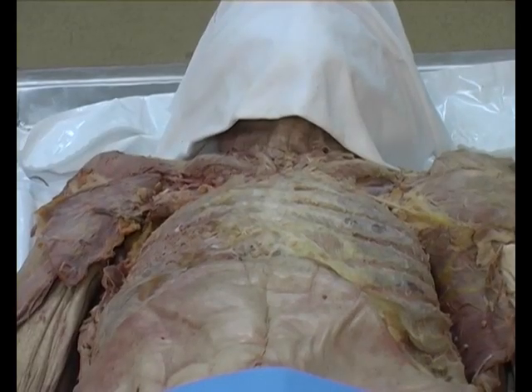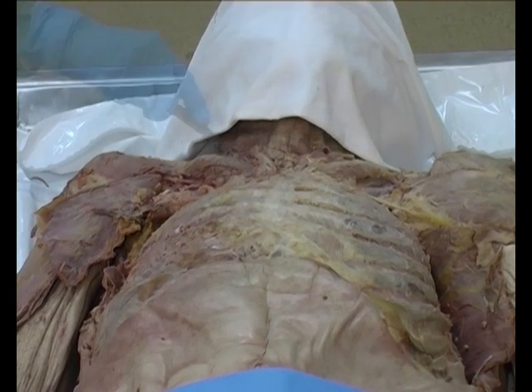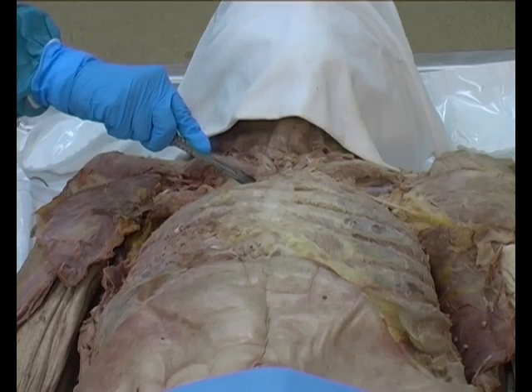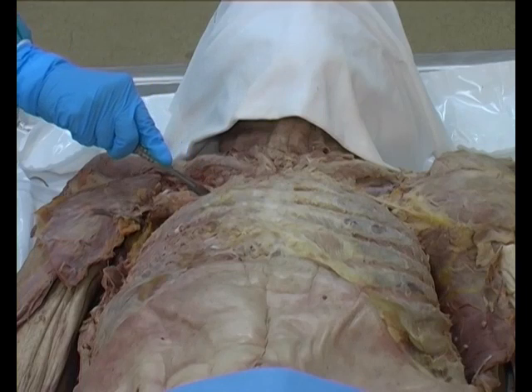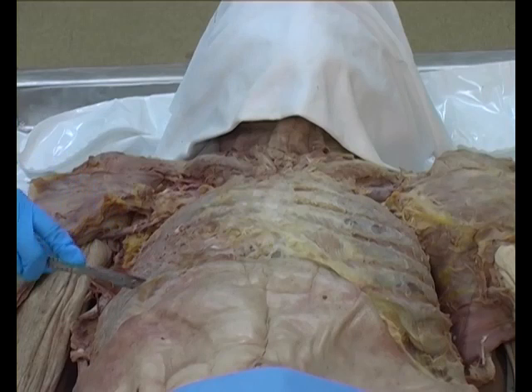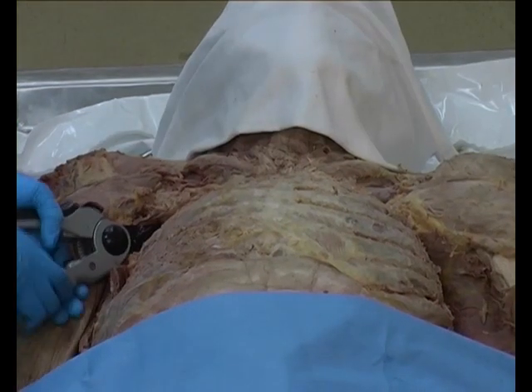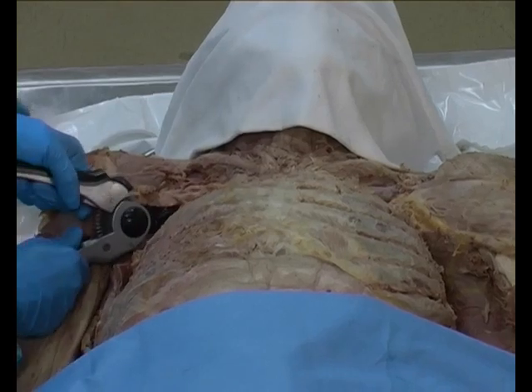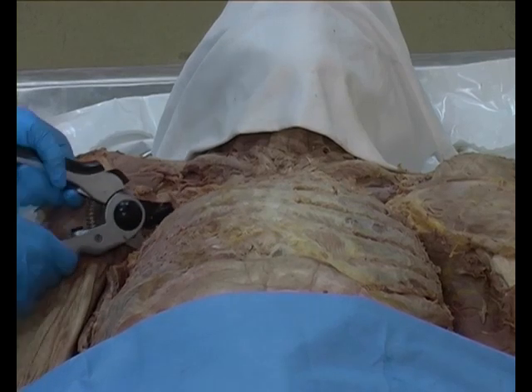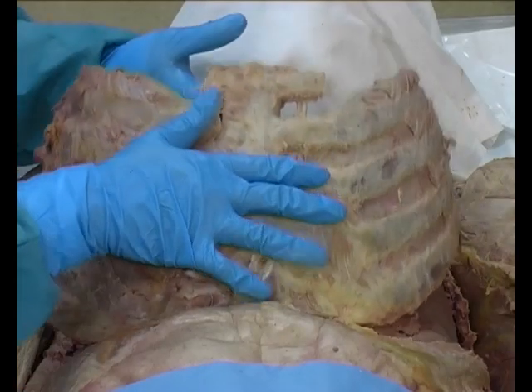Using the scalpel, mark the following on the anterior chest wall. From the sternal angle, along the first intercostal space, to the mid-axillary line. Along the 8th or 9th intercostal space, using the bone saw or rib cutter, cut through the ribs in the anterior axillary line, and remember to cut only through the bone, not deeper, to avoid cutting the lungs.